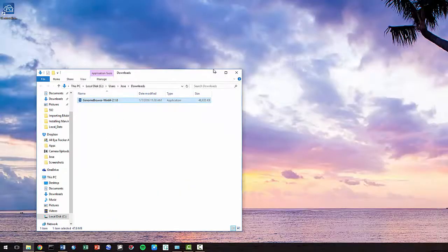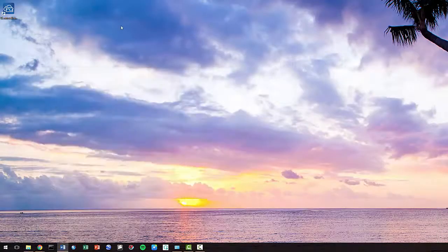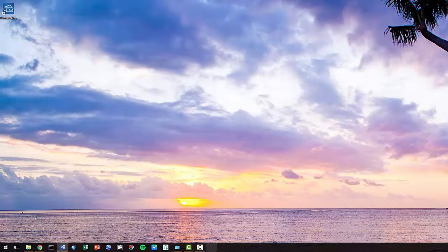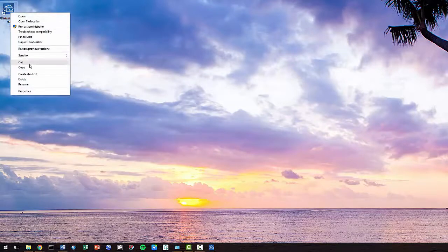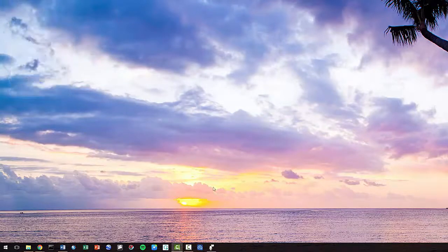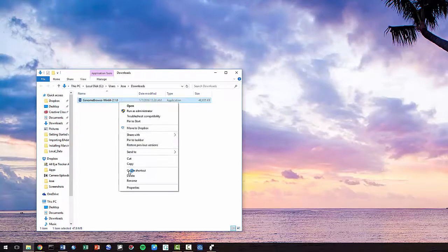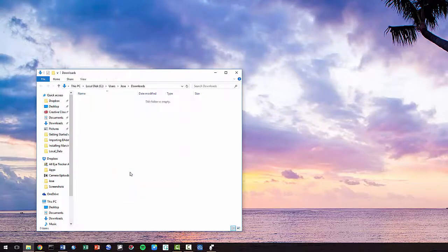We're going to take a look at our desktop, drag the Genome Browse icon onto your taskbar, and then delete the Genome Browse desktop icon. Also, go to your Downloads folder, and delete the Genome Browse installer.